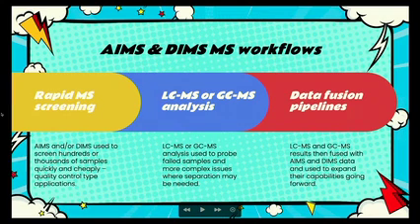So my suggestion is you do a rapid screening first and then gather up a small number of samples that you're most interested in, that are most promising, and then do your LCMS, your GCMS work, find out what's going on. And that's when you're maybe going to do an untargeted run with the LCMS first, get nice separation, or maybe even go straight to running it through a triple quadrupole and quantifying the issues if you've identified analytes of concern, whether it's an aflatoxin, for instance.